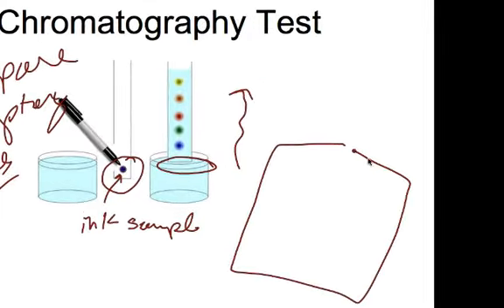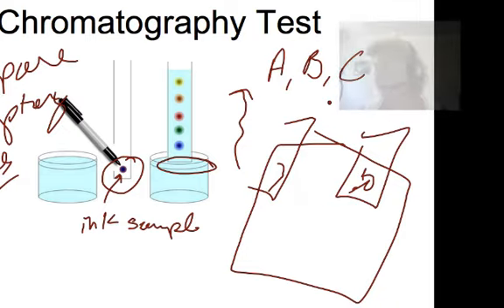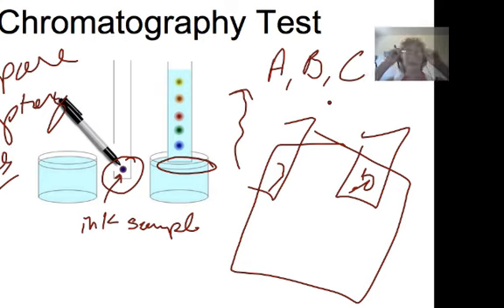There will be enough of the mystery note that each of you can take a little bit, scribble, scribble, scribble, and you're going to compare the samples with the pen and see if you can figure out which of these pens, pen A, pen B, or pen C, matches the note with the actual suspect. Okay, so far so good. And yes, of course, you got your goggles.